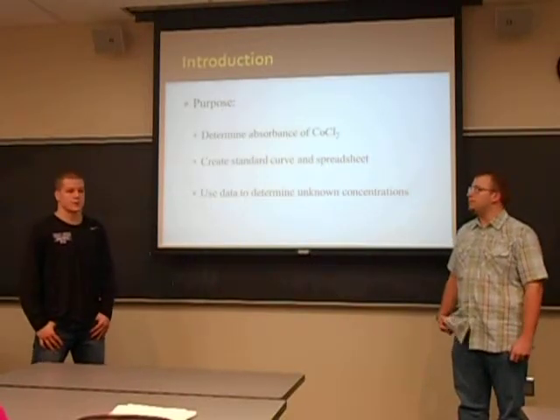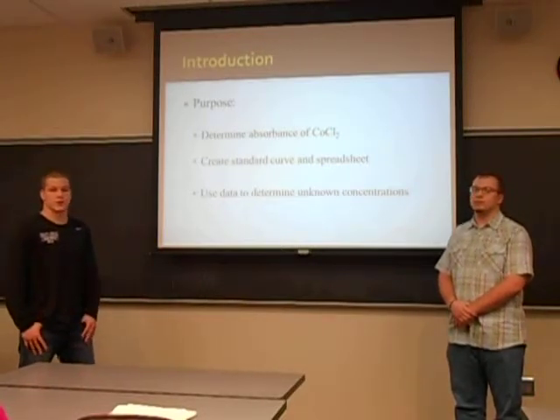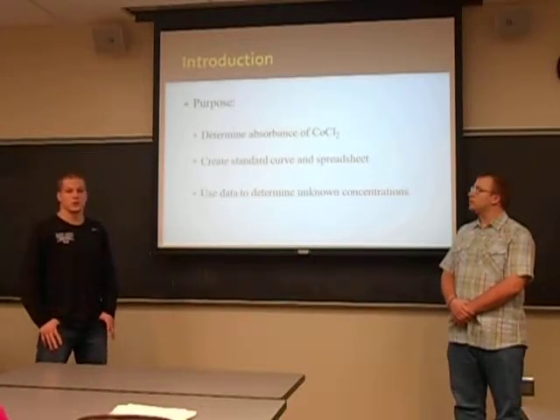The purpose of our experiment was to determine the absorbance of cobalt-2 chloride. We wanted to create a standard curve and spreadsheet using the data. And using the data, we wanted to determine the unknown concentrations that we were given.